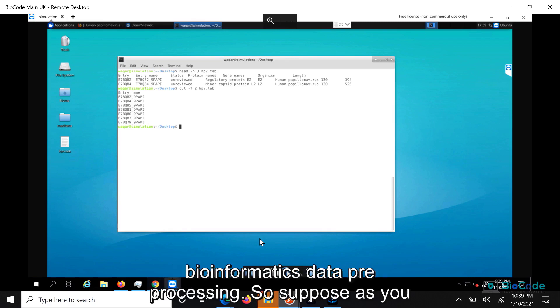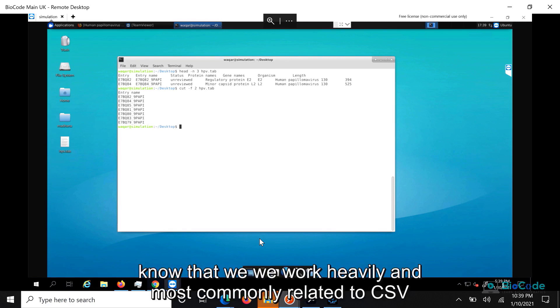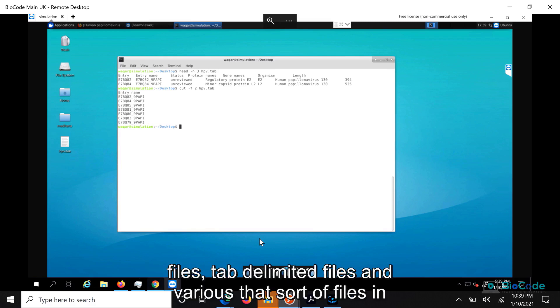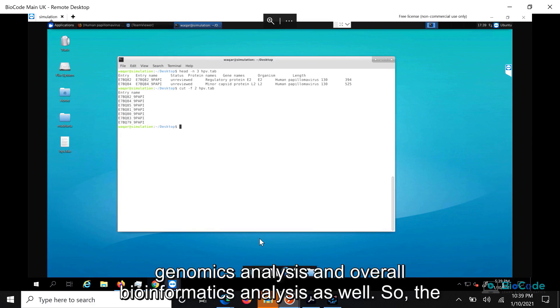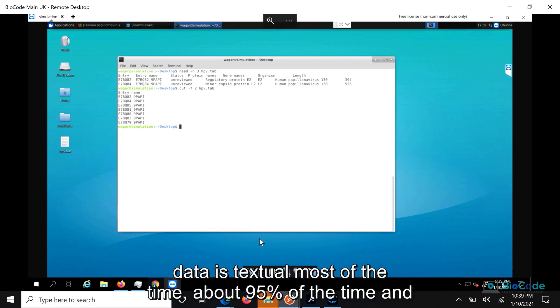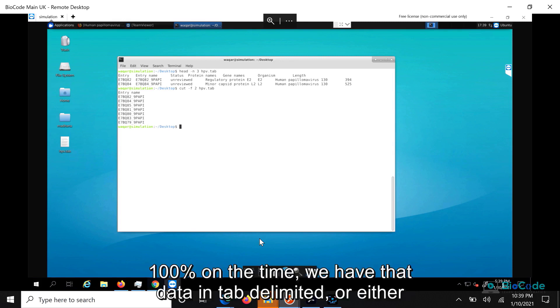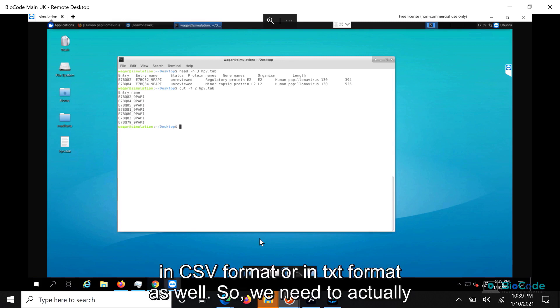Especially for bioinformatics data preprocessing. As you know, we work heavily and most commonly with CSV files, tab delimited files, and various data files in genomics analysis and overall bioinformatics analysis as well. The data is textual most of the time — about 95% of the time — and practically always in tab delimited, CSV, or TXT format.